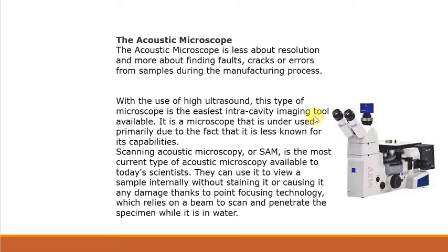Then next is the acoustic microscope. This acoustic microscope is less about resolution and more about finding faults, so cracks or errors in samples during the manufacturing process. With the use of high ultrasound, this type of microscope is the easiest intracavity imaging tool available. It is a microscope that is underused, primarily because it is less known for its capabilities.